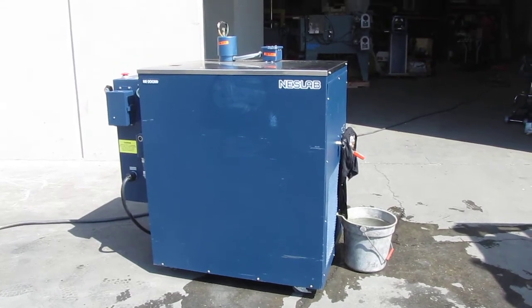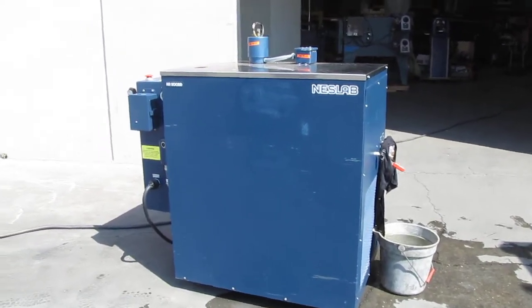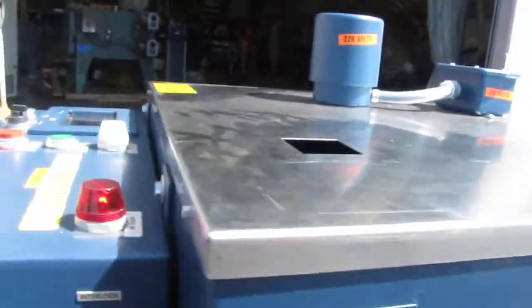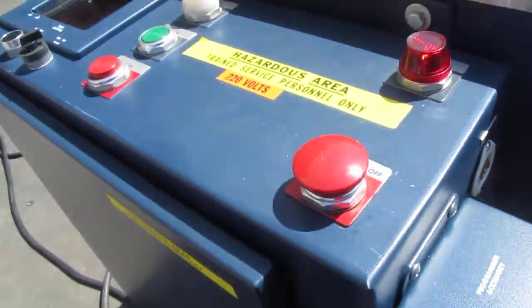Here we have a Neslab HX200DD. This is a water-cooled recirculating water chiller. We got it hooked up to 230 volt three-phase power.